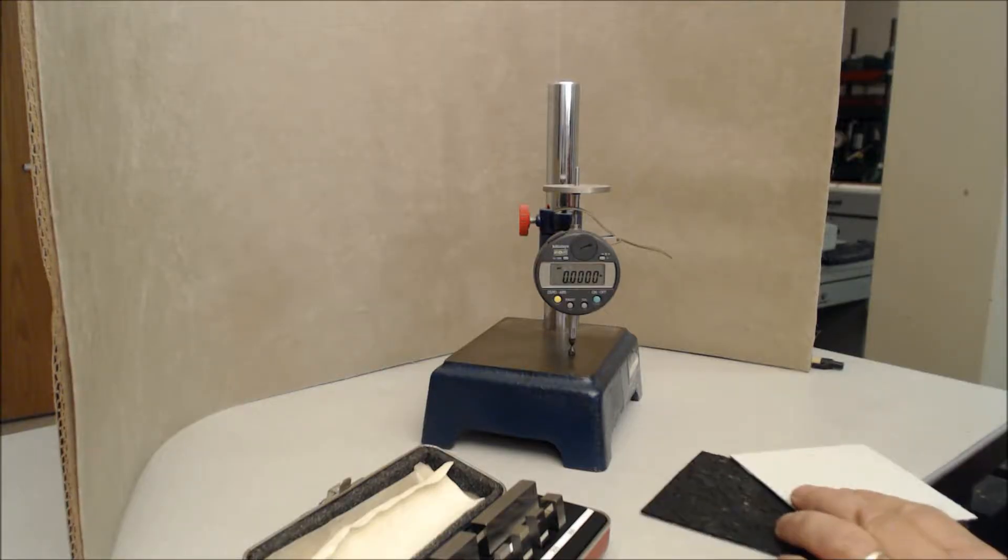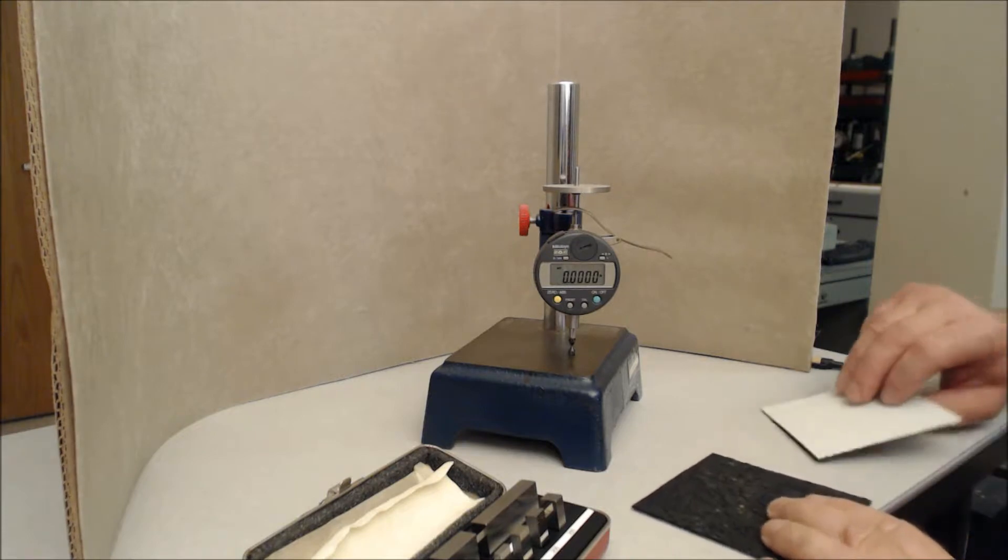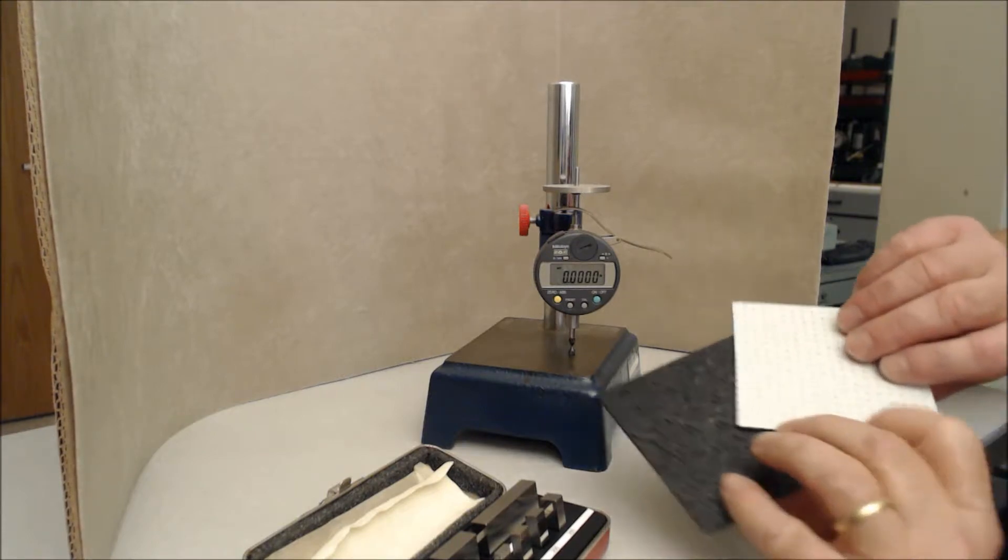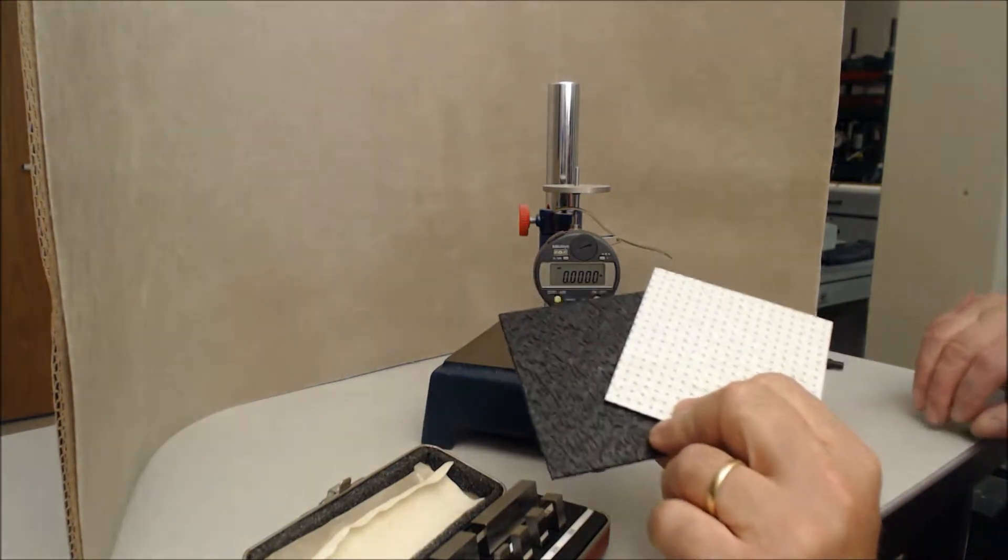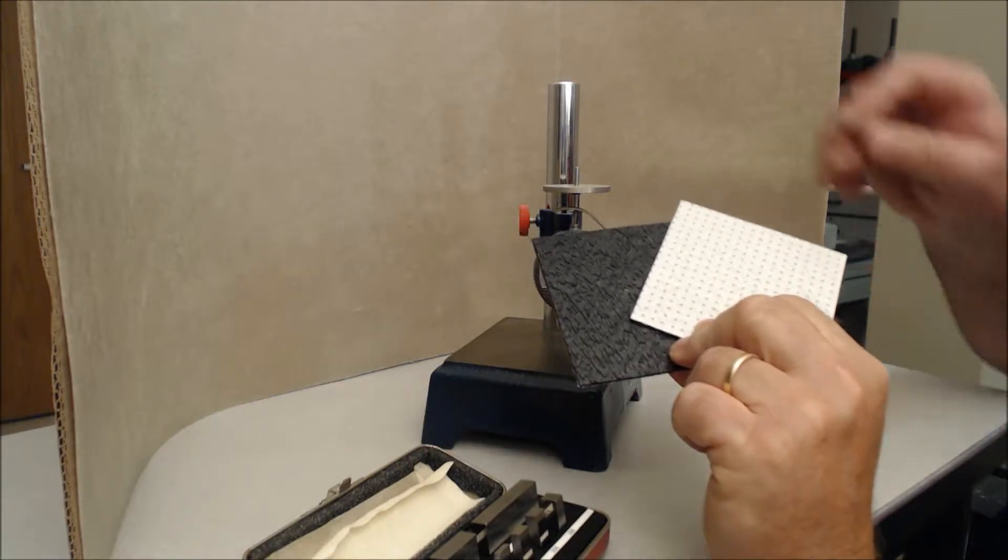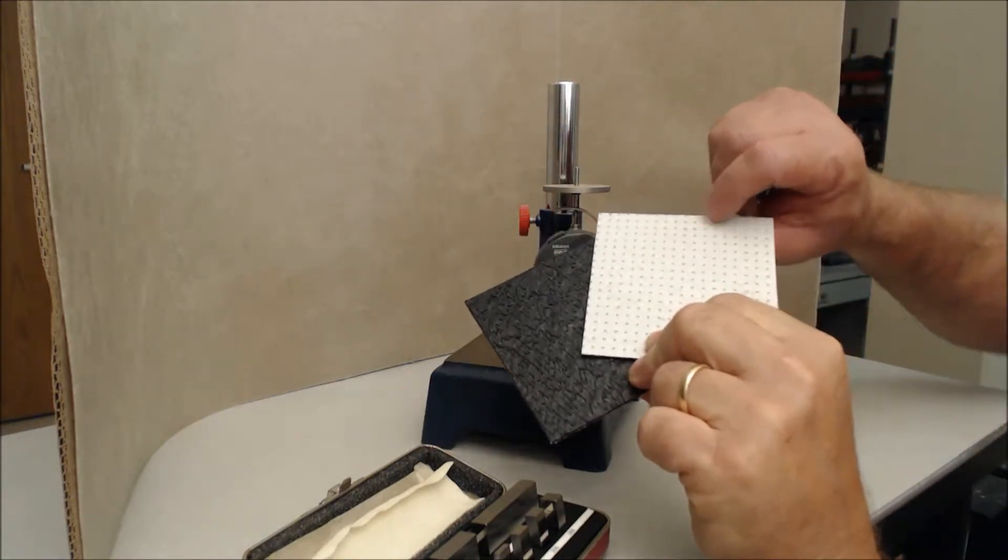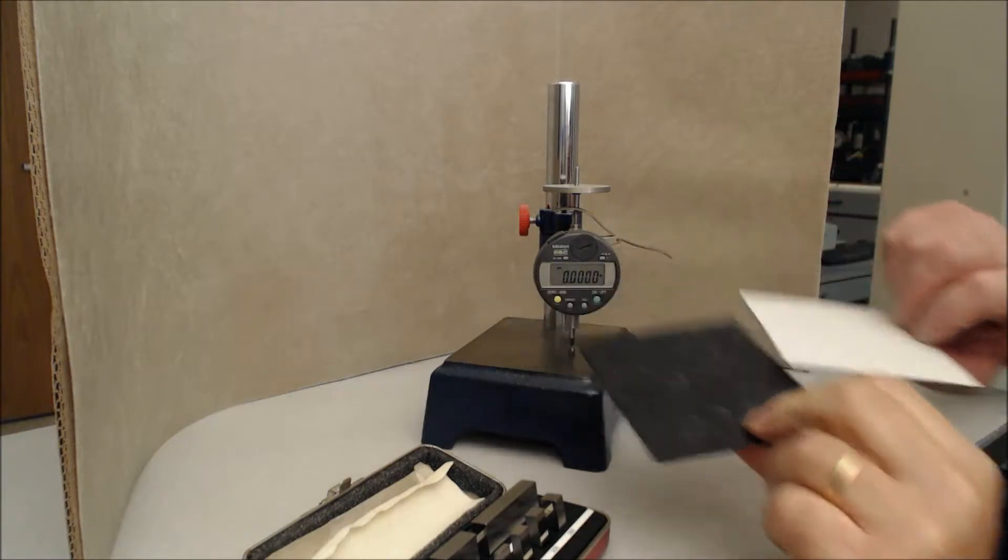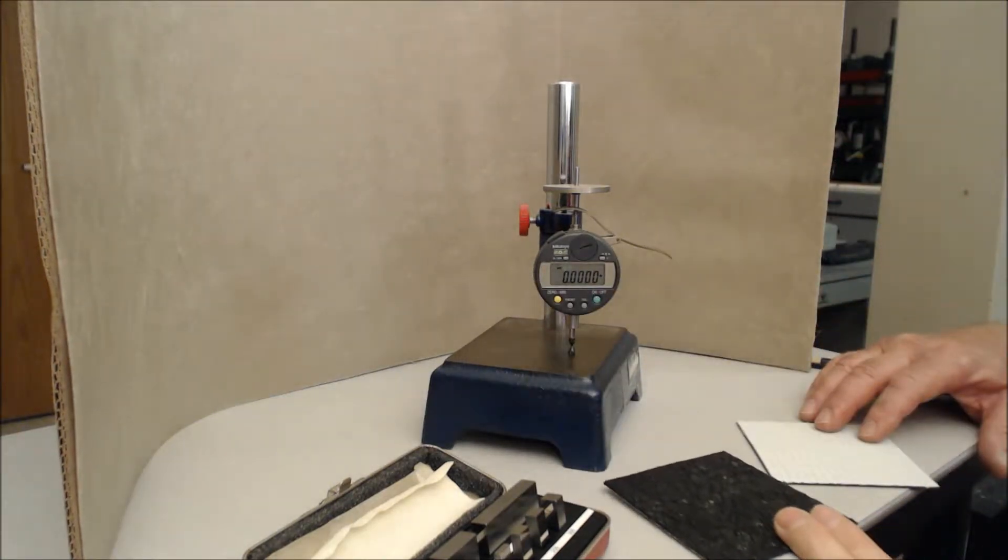We're back at GSI again, and here we're testing the core thickness of textured GM membranes. I have two of them here, two different brands that we have. One is from a blown film line, and the second one over here is from a cast line. I'll give you the two different readings.